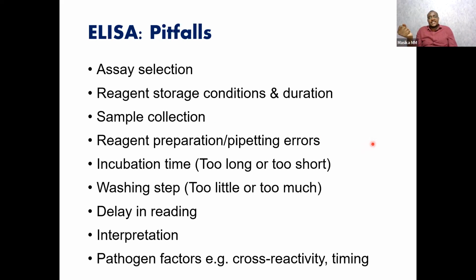Sometimes when you're pipetting, you might skip adding a sample. Maybe you're only adding 10 microliters of your sample and you forget. You skip that well. You think you have added, but you have not. That gives you a false negative. Maybe that sample was positive, but you didn't add any. The well will not be empty because you'll already have things inside, but you didn't add the sample itself. So there's nothing you're really measuring. You're measuring an empty well.